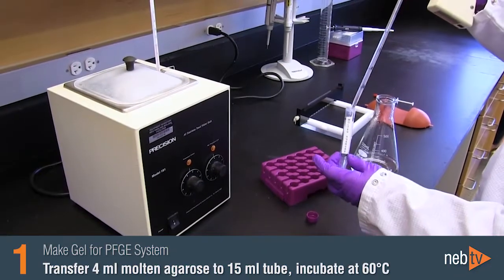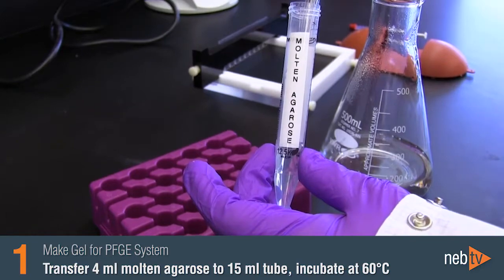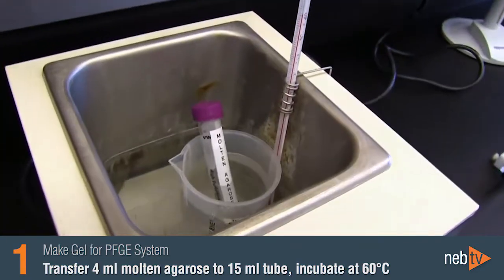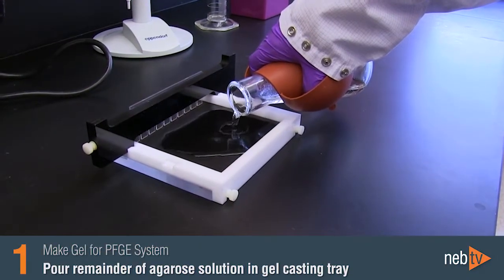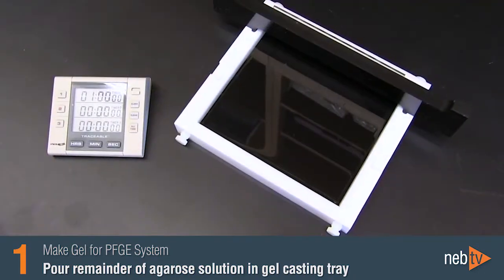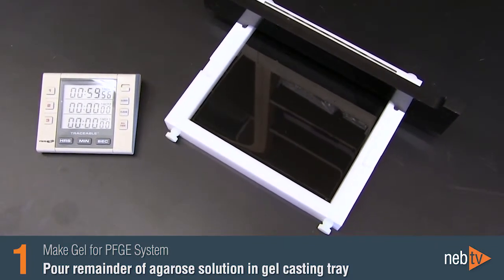Transfer 4 ml of the molten agarose to a 15 ml conical tube and place it in a water bath at 60 degrees Celsius. This aliquot will be used later to seal the wells containing your PFG marker plugs. Pour the remainder of the hot agarose solution from the flask into your gel casting tray. Let that gel cool down at room temperature until it is solidified, usually about 30 to 60 minutes.